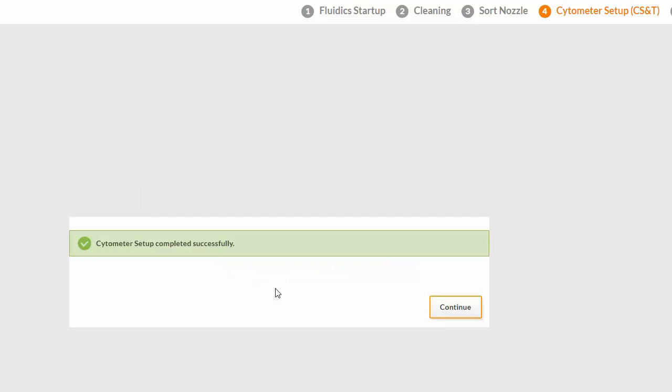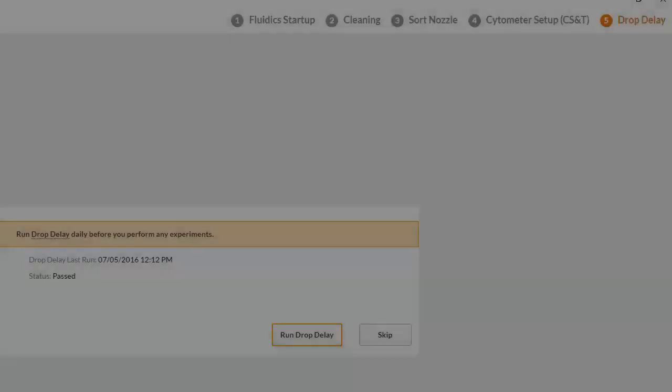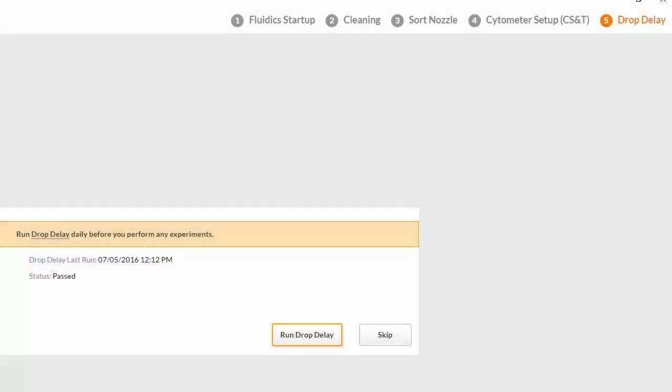Once the cytometer setup is complete, click Continue. The final step in the procedure is to perform drop delay. Prepare the BD AccuDrop sort beads according to the package directions.